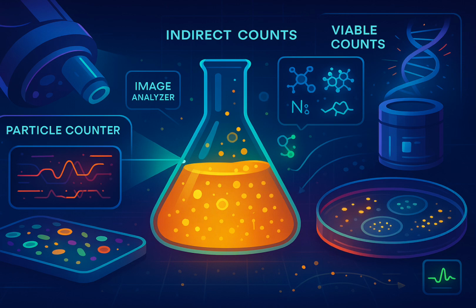That's the principle. It's great because it works in murky or colored samples where OD fails. It's super fast, results in minutes. And very sensitive. Yeah, it can detect tiny amounts of ATP. You can even filter a sample to concentrate cells, then measure ATP, making it even more sensitive. And there are tricks to measure bacterial ATP specifically by getting rid of ATP from other cells first.